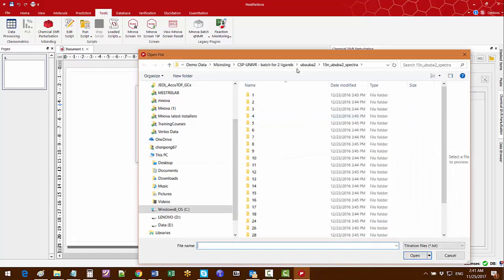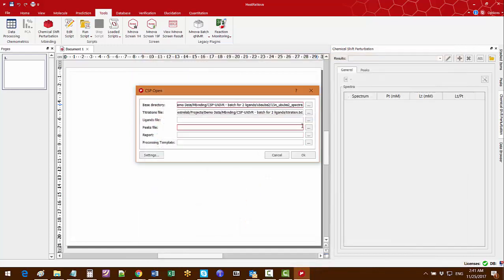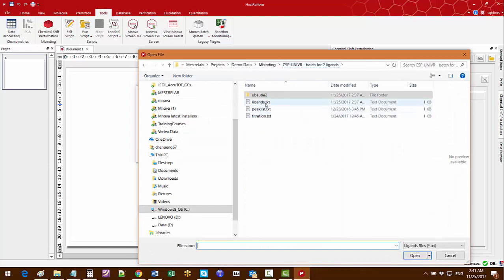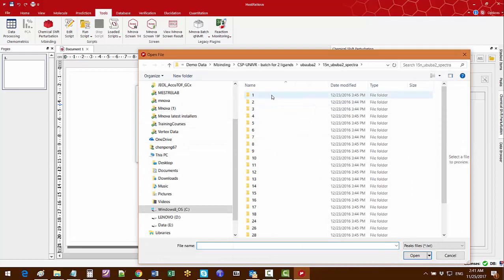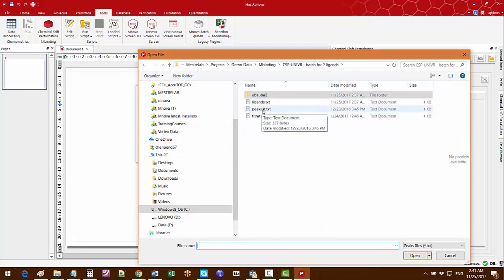The titration file specifies the spectral names and concentrations of the titration series. The ligands file specifies the names of each ligand. The peaks file specifies the assigned HSQC peaks for which we are going to follow the chemical shift perturbation.